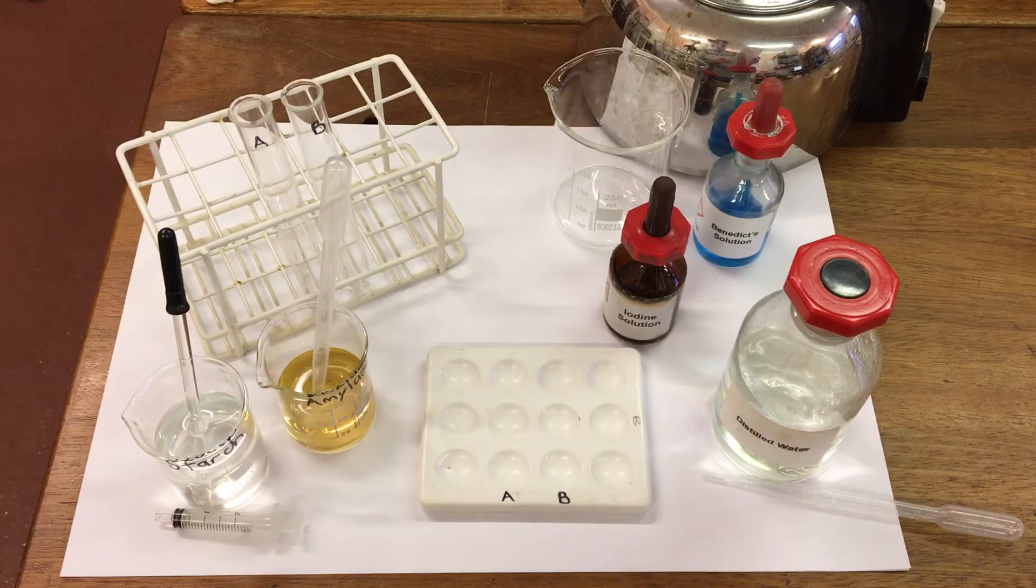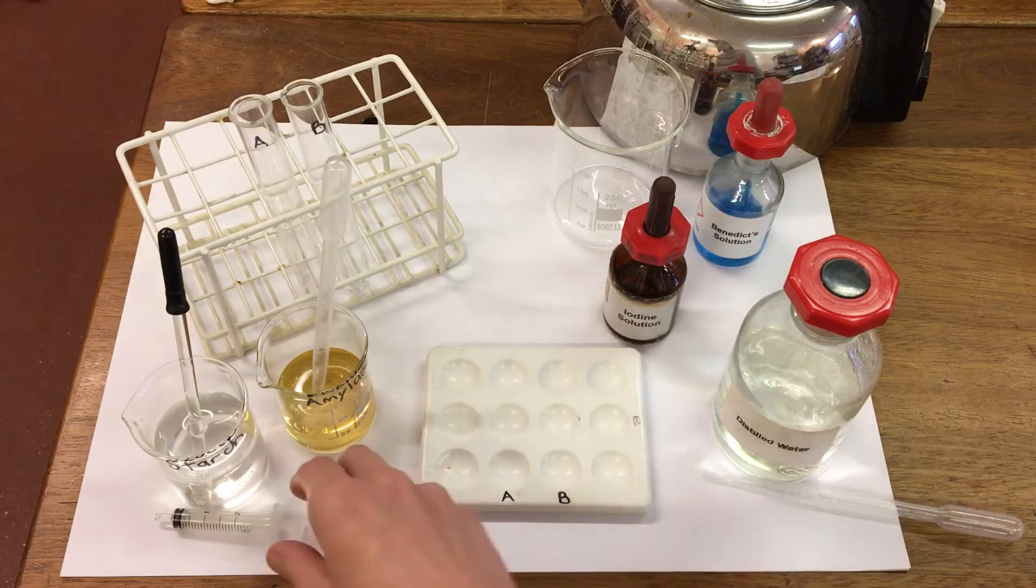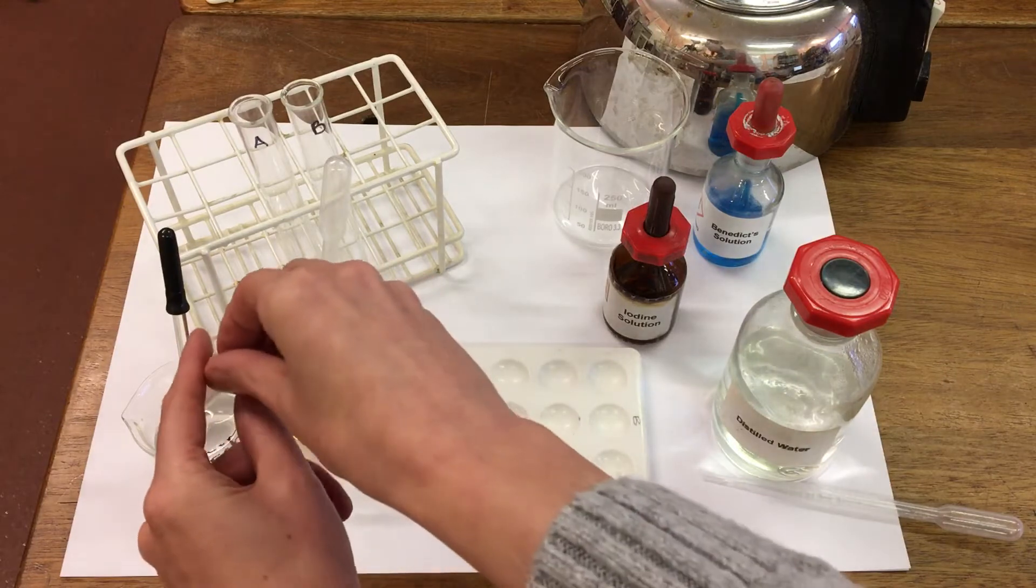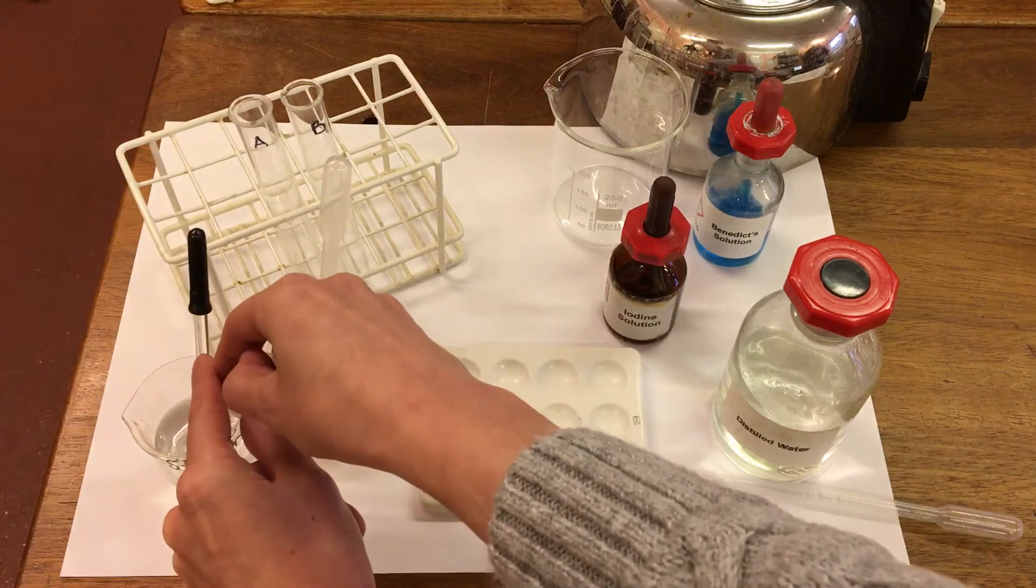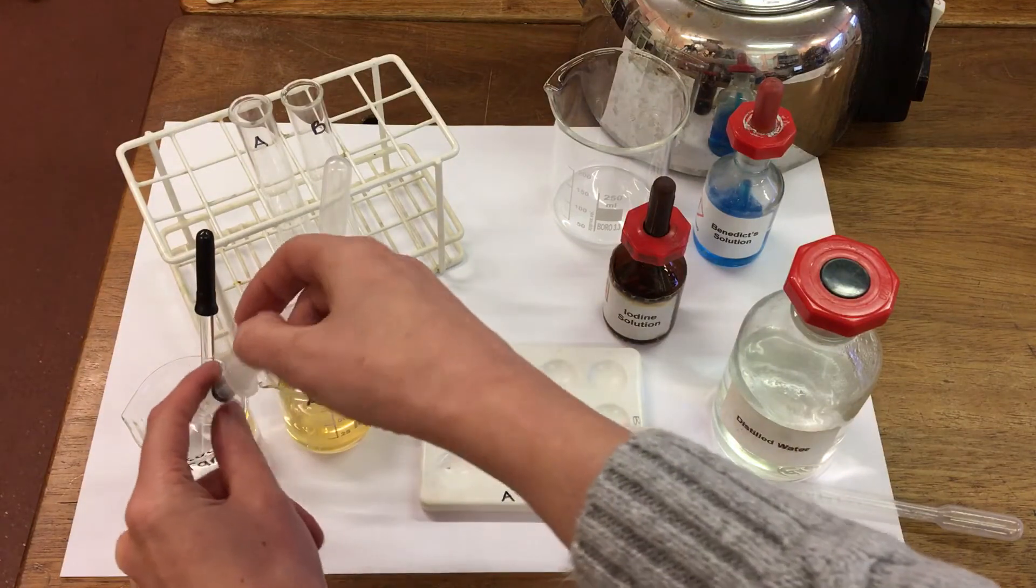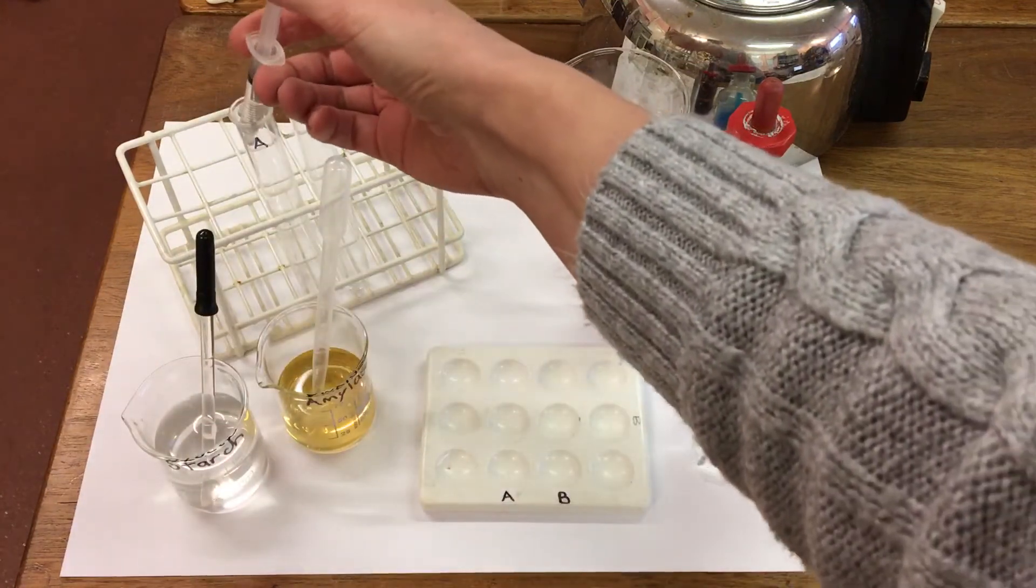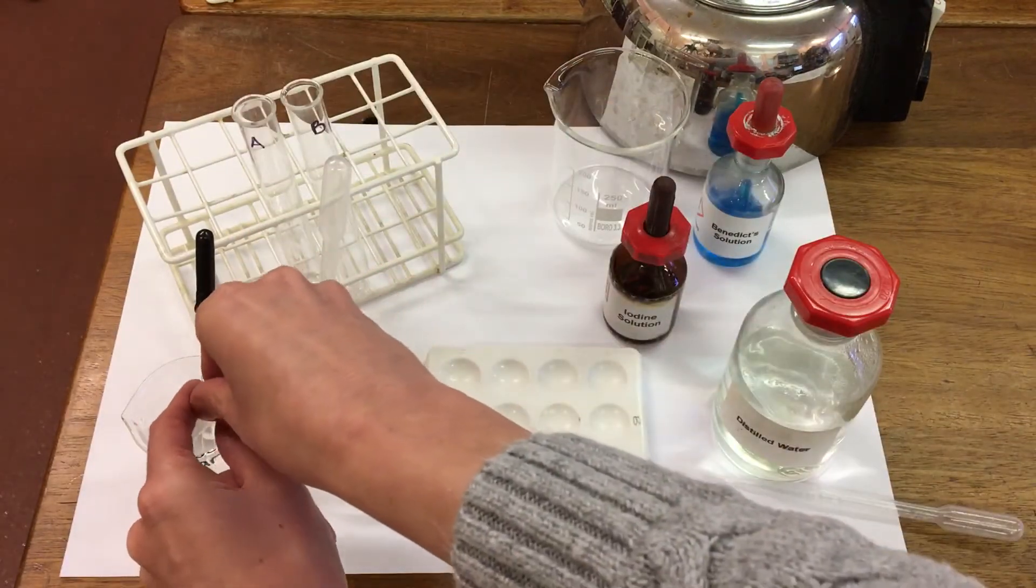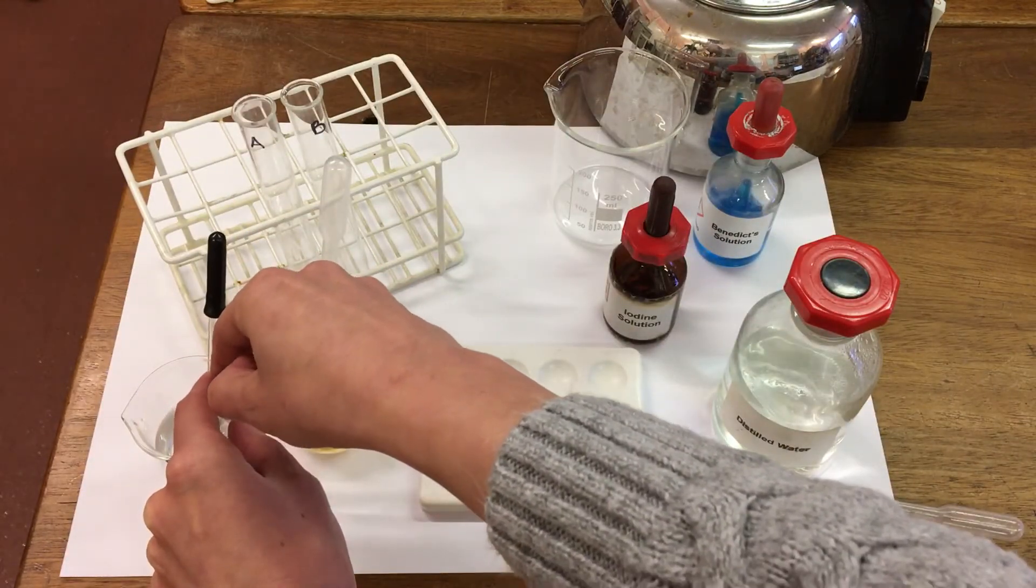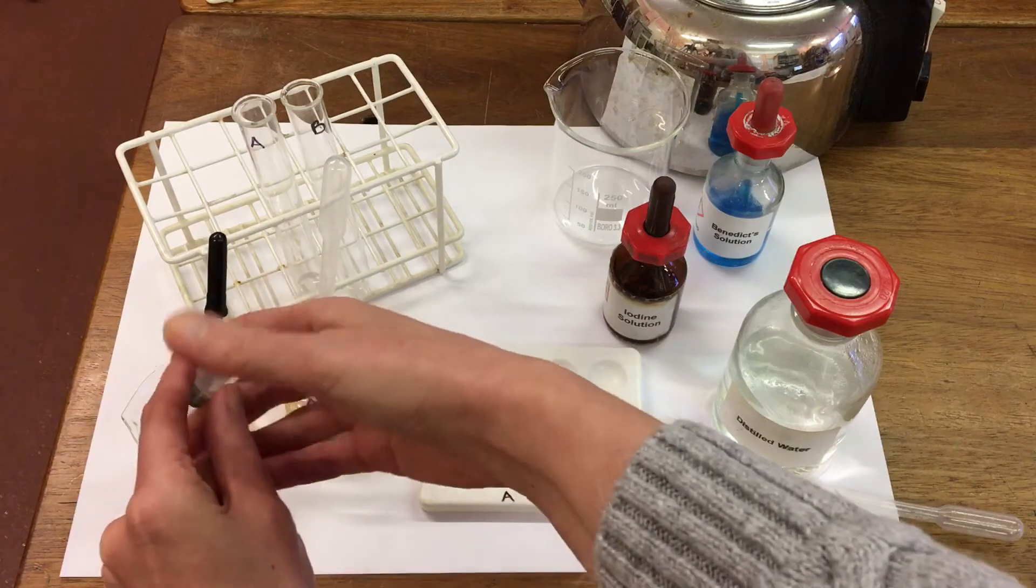So first of all, I'm going to set up some test tubes containing starch. I'm going to add 2 ml of our starch solution to test tube A and 2 ml of the starch solution to test tube B.